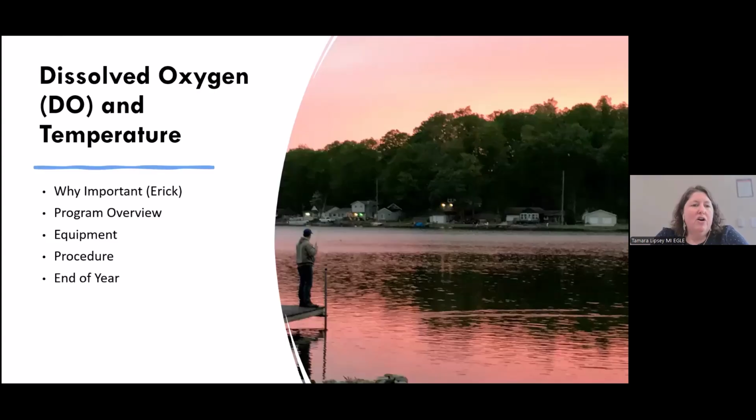So Eric's going to go over why dissolved oxygen is important, and give a program overview, and then I will go through the specifics of the equipment and the procedure and what to do at the end of the year.